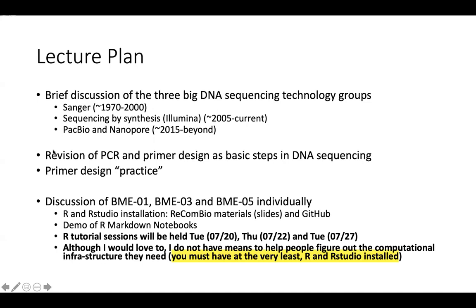In the second part, I'm going to revise PCR and primer design, because these are basic steps in DNA sequencing. And we'll have a primer design practice where I will show you how to do an in silico PCR using the UCSC genome browser.